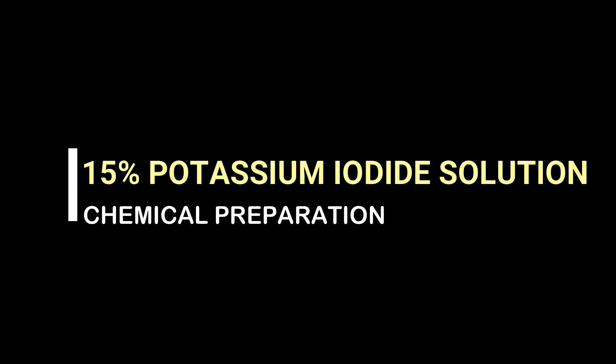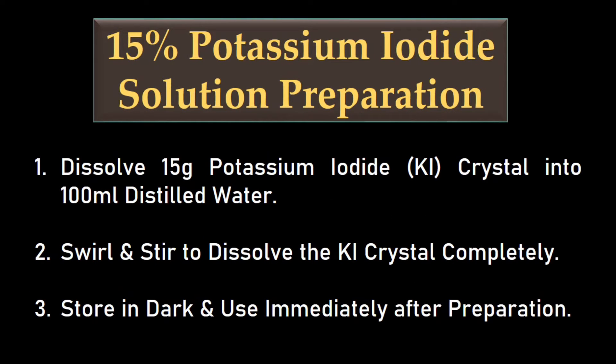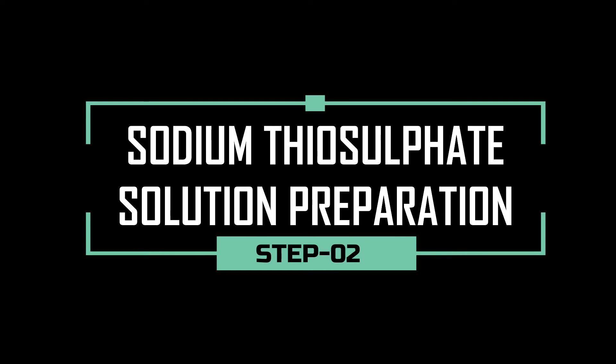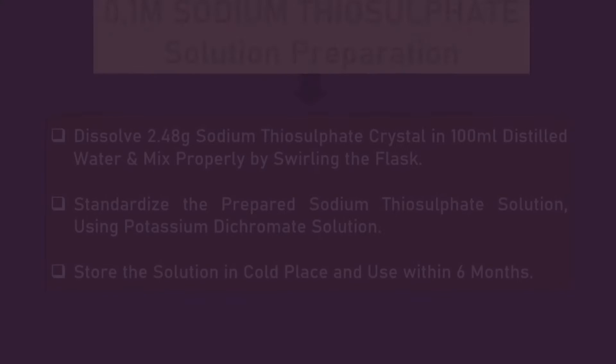We can prepare 15% potassium iodide by dissolving 15 grams potassium iodide crystal into 100 ml distilled water. Now we will prepare the expected 0.1 molar sodium thiosulfate solution.